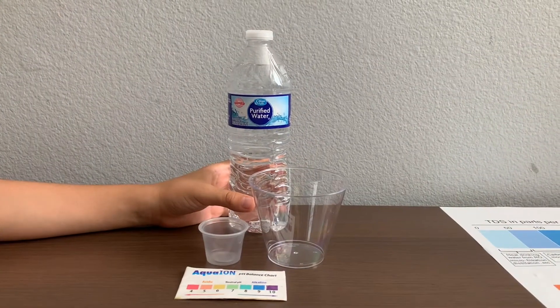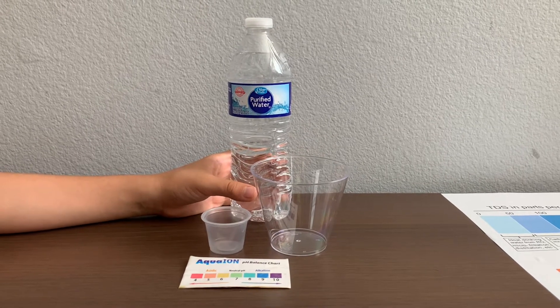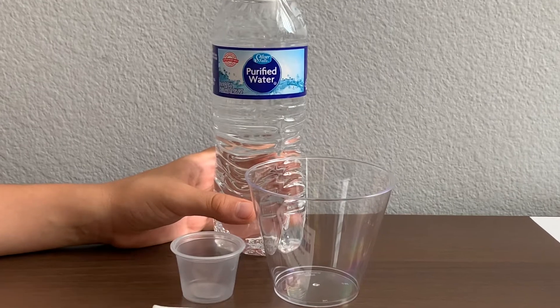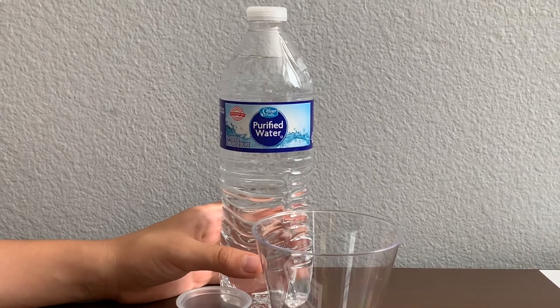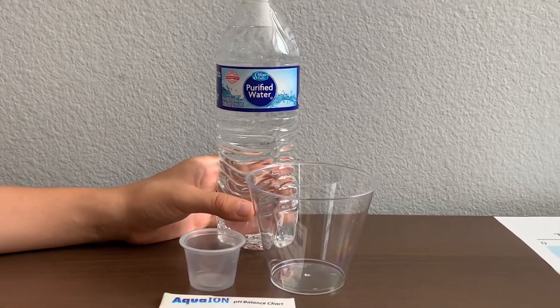This is Silver Falls Purified Water, sourced from North Carolina, USA. The water passes purification by reverse osmosis. The bottle is BPA-free and 100% recyclable. It's sold at the Family Dollar Store in Arizona.